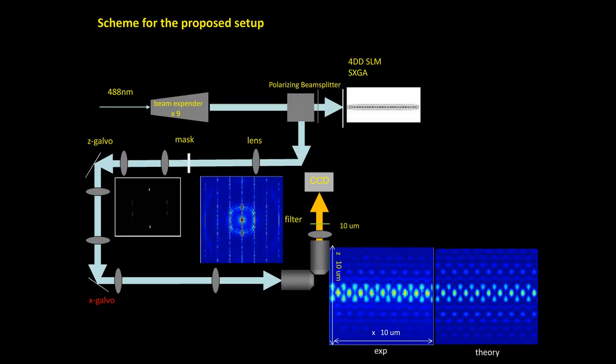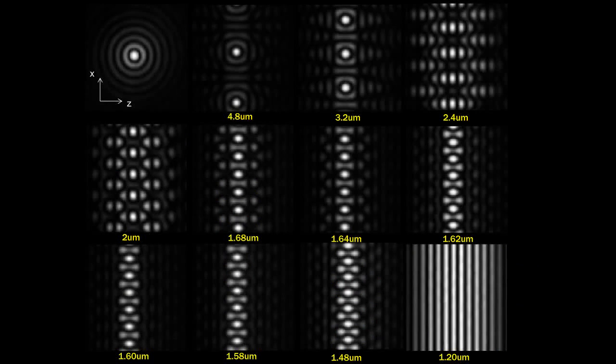So this is what we demonstrated for the first time: a multi-beam, then Bessel beams, doing coherent interference. These are all the experimental data. As you can see, there's a single Bessel beam, and at different distances they have different interference patterns. And for this one, from around 1.6 micron, the background from the Bessel function is suppressed, and all the energy is concentrated at the center. So this is what we want, and these are all the experimental data.